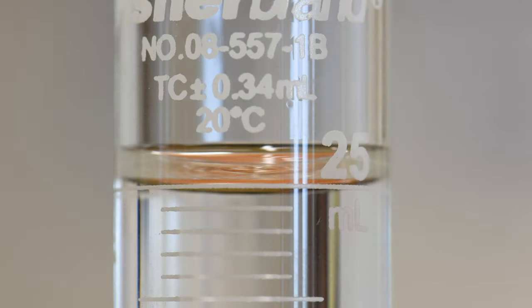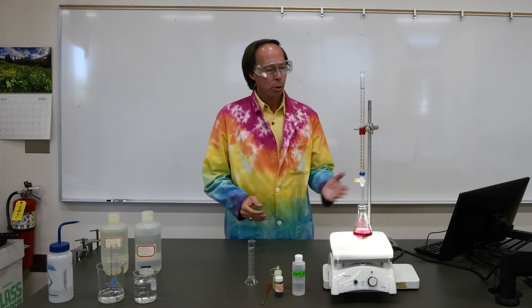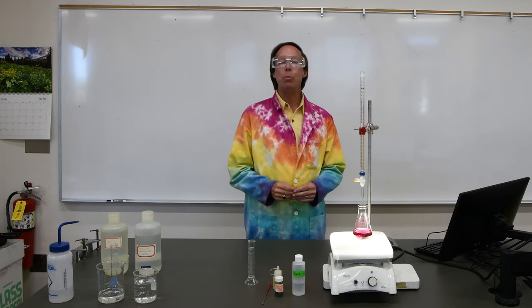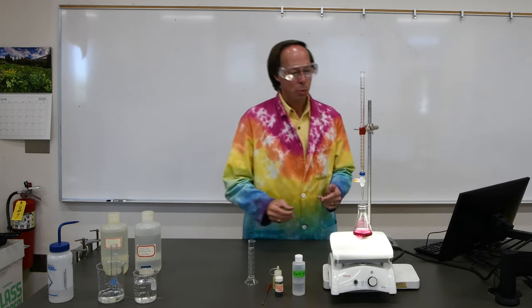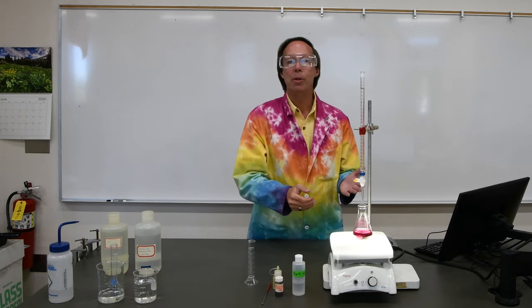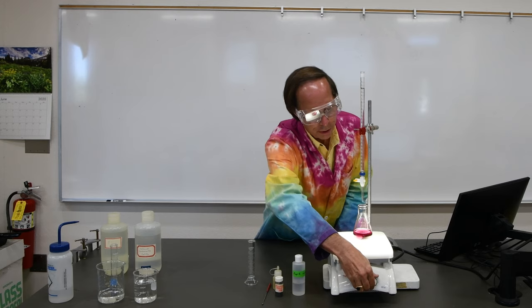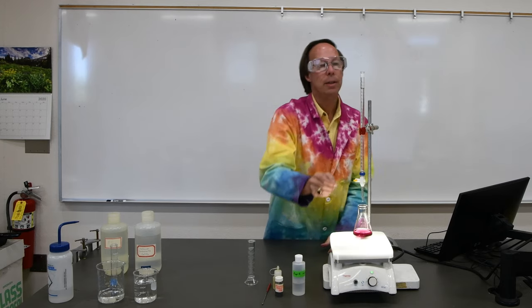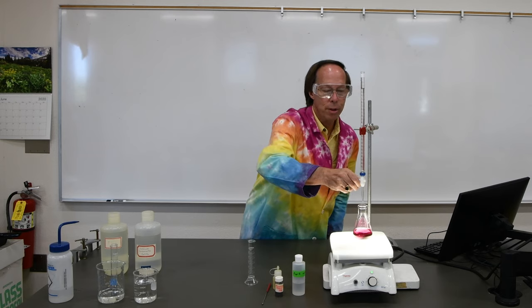I've gone ahead and measured out a sample of the unknown calcium carbonate solution for our first official trial. Now that we've done our trial run for the unknown, and it looked like it took just a little bit less than 2 milliliters of EDTA, so this time we'll sneak up on it. We'll maybe add a milliliter or a milliliter and a half, and then go dropwise. So let's go ahead and start the stirrer here.